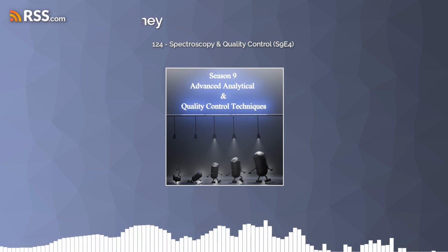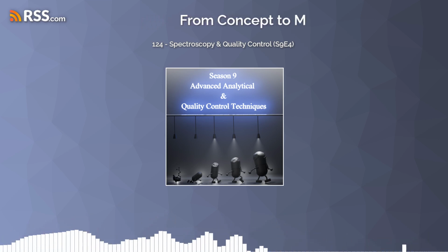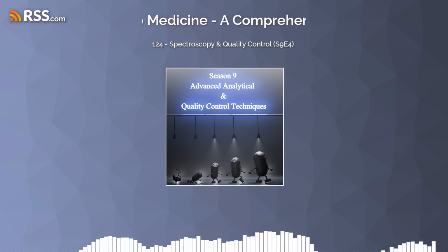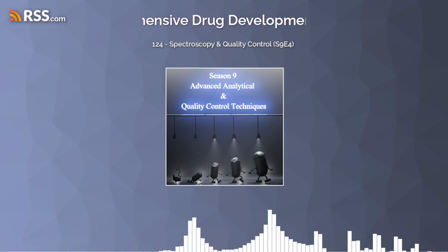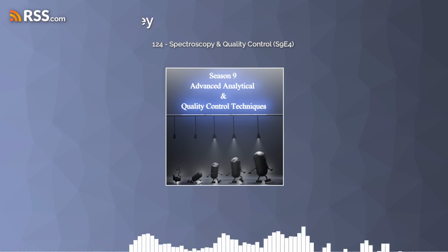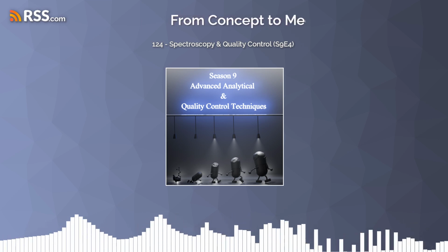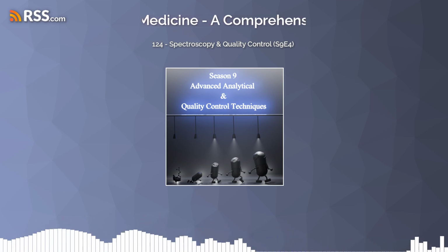Exactly. However, it can sometimes lack specificity, meaning that different compounds might have similar absorption spectra. So it can tell you that something's there, but it can't always tell you exactly what it is. It's like if you're trying to identify a fruit based on its color. Right. There's a lot of red fruits. Exactly. So it narrows it down, but it doesn't give you the definitive answer. So that's one limitation of UV-Vis.